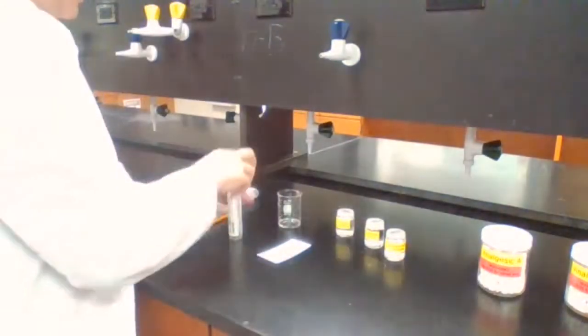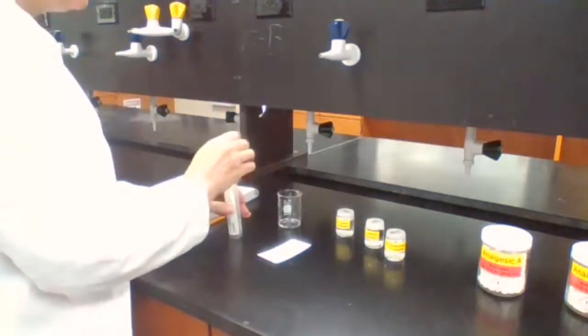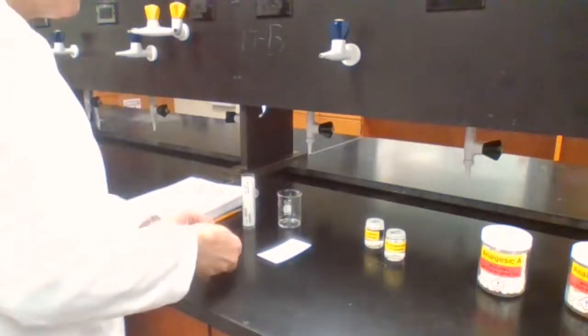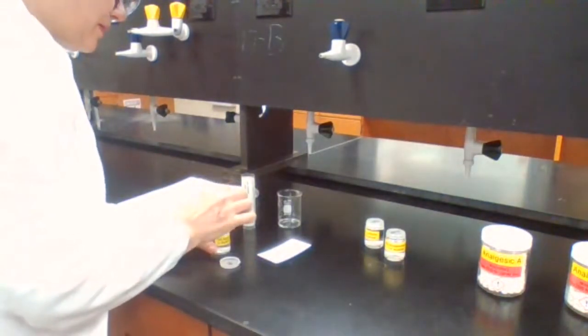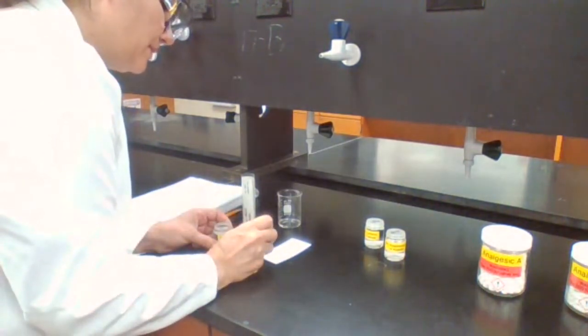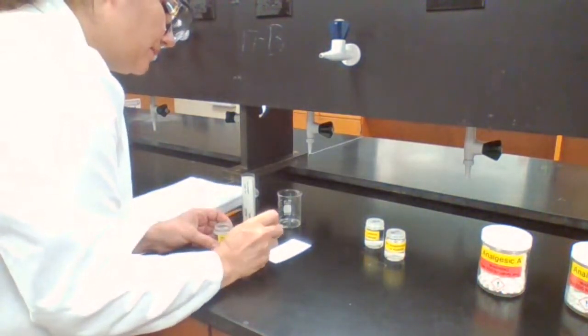So the first one is going to be aspirin. I put one spot of aspirin on the left side.